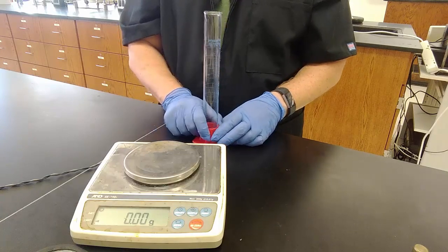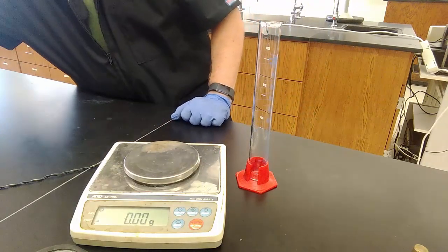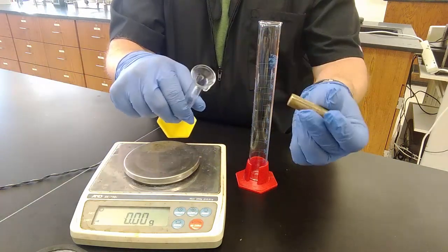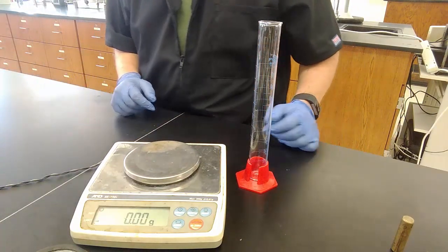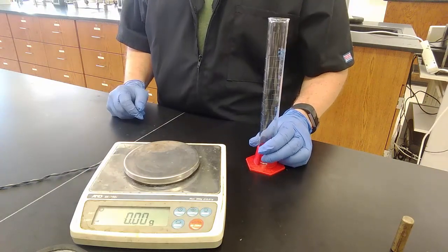Okay? I'm using a 100 milliliter graduated cylinder because if I tried to use a 10 milliliter graduated cylinder, like I'll use in the next one, it just doesn't fit. Okay? So it says to put about 50 milliliters of water into a 100 milliliter graduated cylinder. About 50 milliliters.